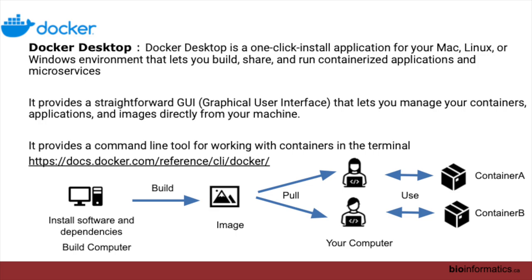The emphasis here is usually when you build an image, you build a container, you put in only what's really needed there. You don't want to bloat it up with a whole bunch of software doing a whole bunch of different things. It has a specific purpose. We'll pull those down and run things through them for a different purpose. We'll use a different container to do something else. You'll see that as we go through the exercises.